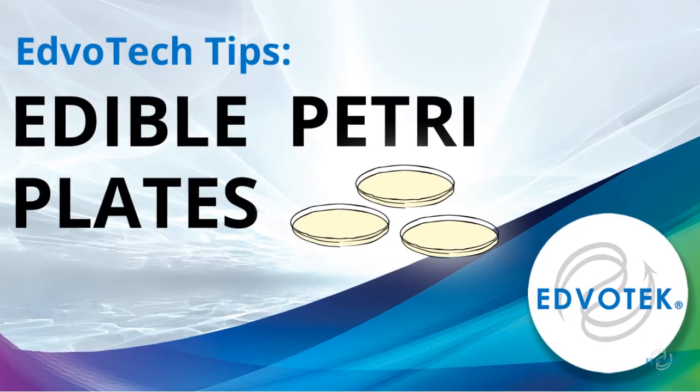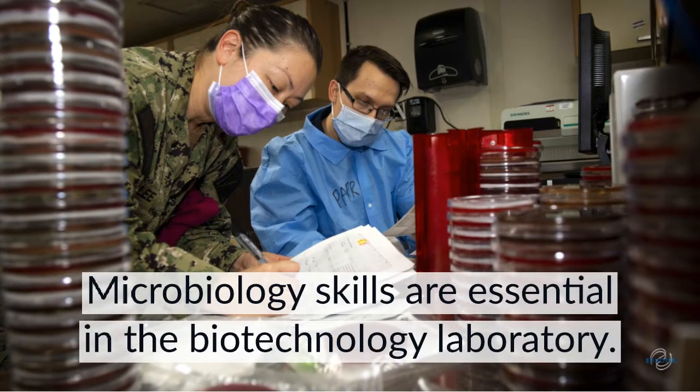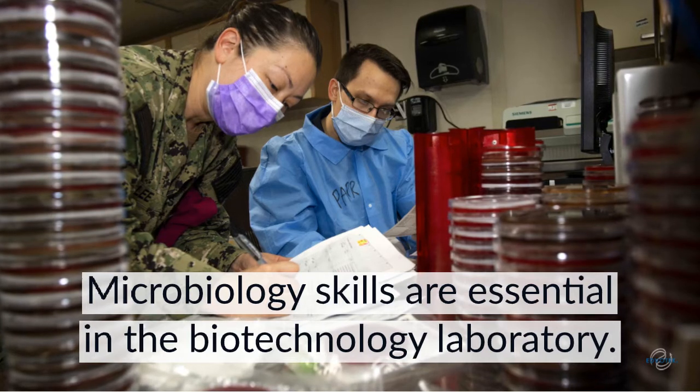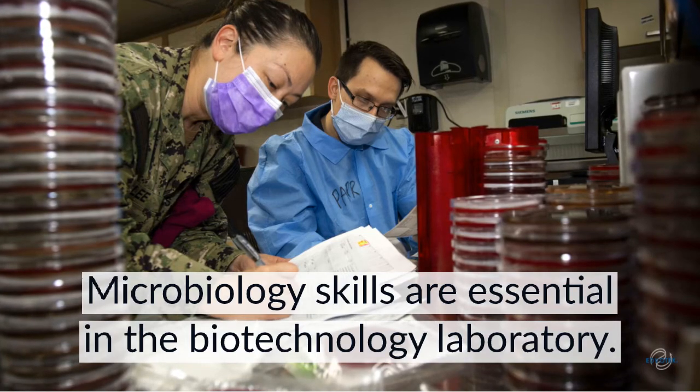Edvotech Tips: Edible Petri Plates. An important step in many biotechnology experiments is creating and harvesting bacteria colonies. Colony isolation is used in microbiology to identify and test bacteria strains, and in biotechnology to create competent cell cultures for transformation.